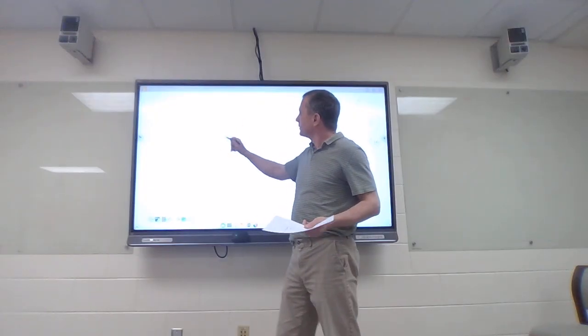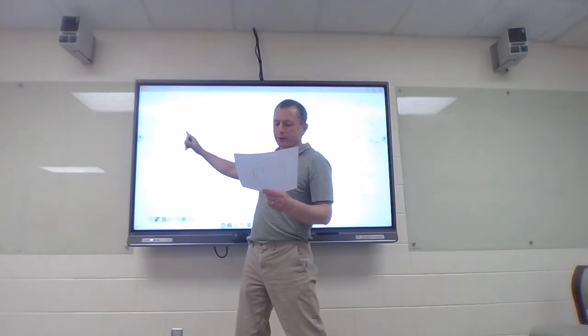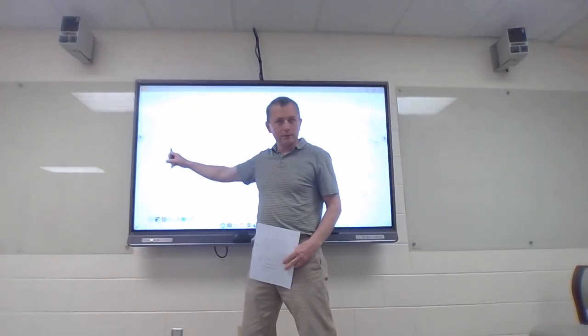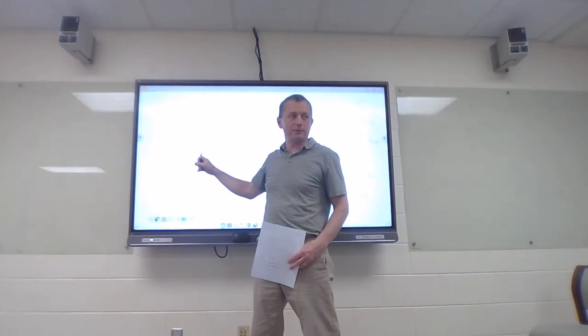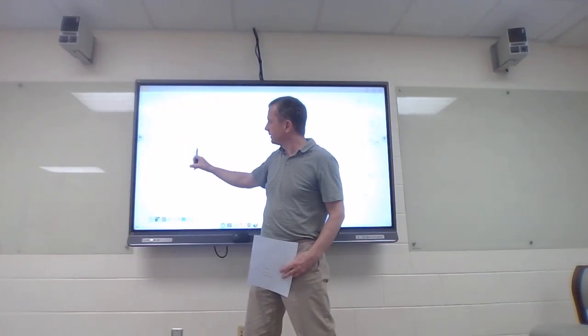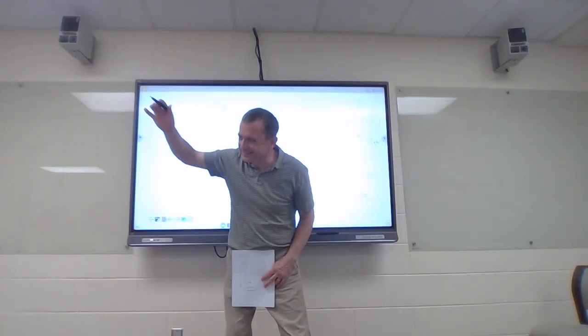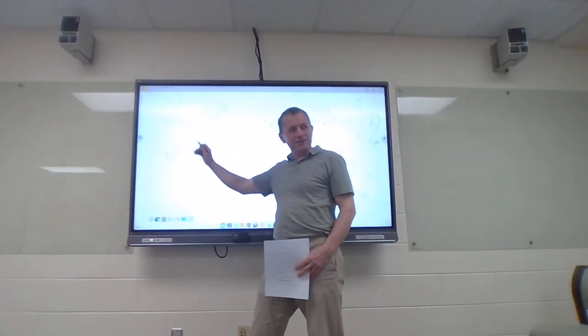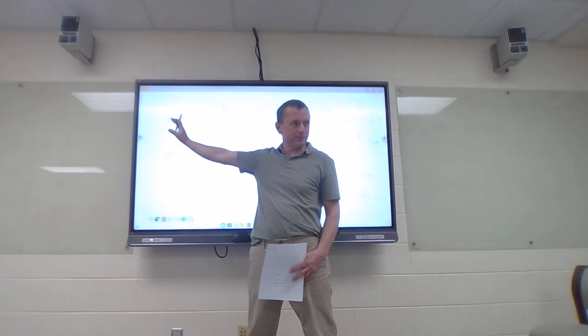All right. So anytime, what I want you to see in this pattern is if you look at this one up here, that peak of 6 is a doublet. So it's integrating to 6 and it's a doublet, 2 peaks next to 1 hydrogen. So if I see something integrating to 6 in a doublet, I'm always looking for what we call that isopropyl group, right?